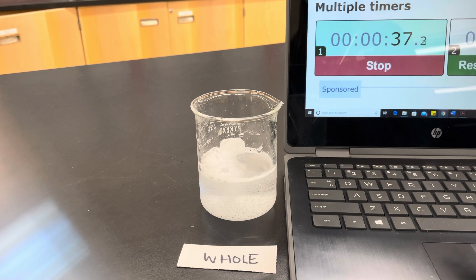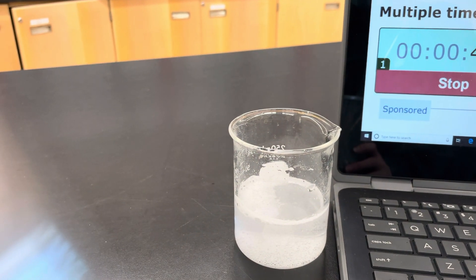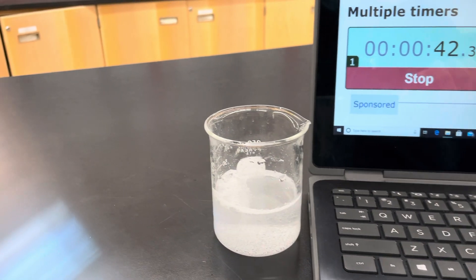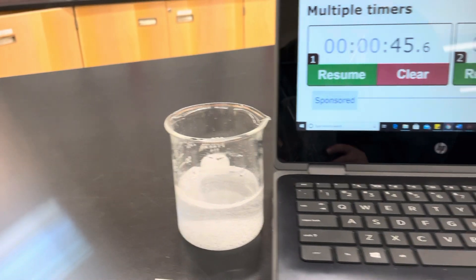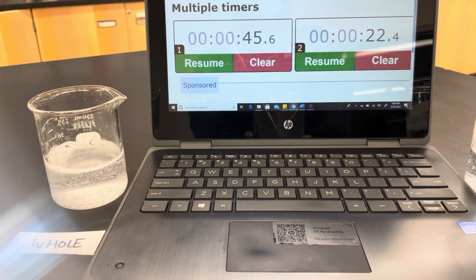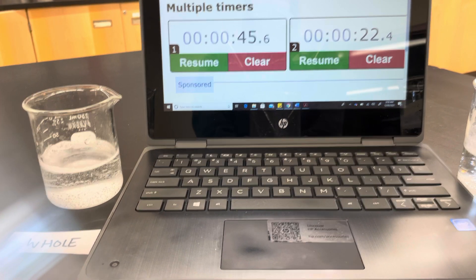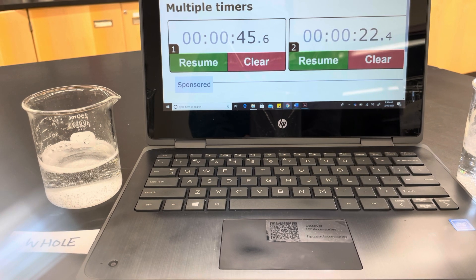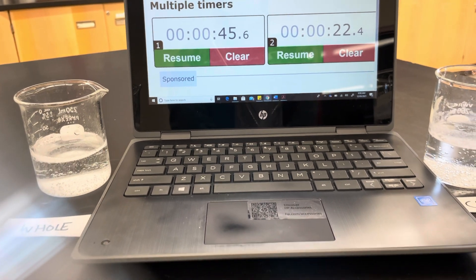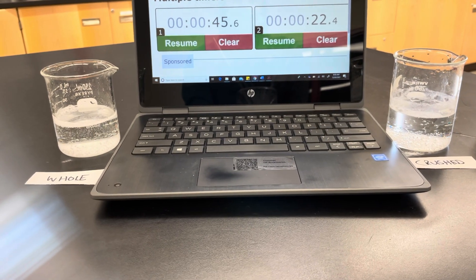Still a little tiny bit on the top bubbling, and now it's just residual bubbles — stop. Our whole tablet took about 45.6 seconds, and our crushed tablet took about 22.4 seconds. Quite a bit of a difference by changing the surface area of the tablet.